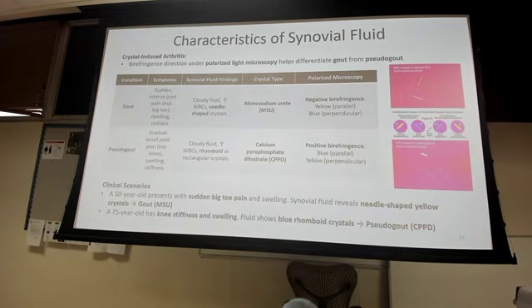But make sure you're starting this, because I will present this to you, okay? All right, here we go. Here's that gout and pseudo-gout. I know y'all know this already, but for whatever reason, I got to test y'all again on it. So just remember that the crystal for gout is MSU, negative birefringent, and pseudo-gout, that CPPD, is positive, okay?